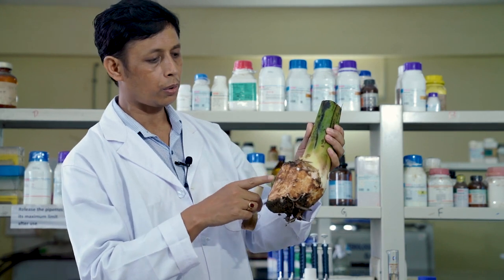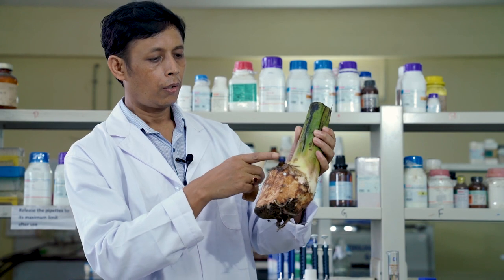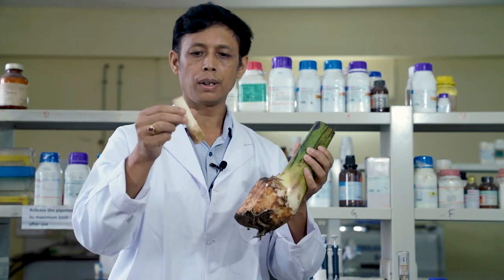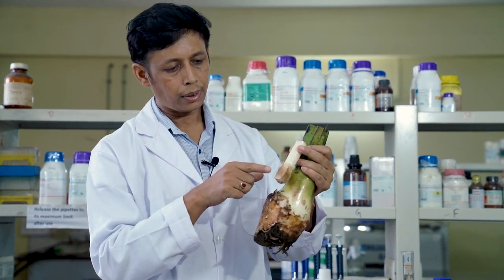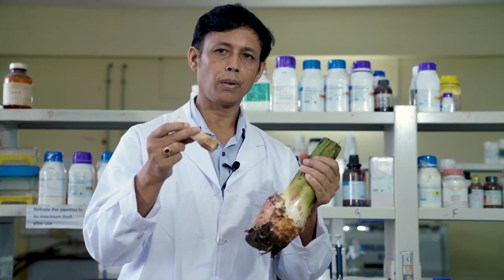Now this explant has two parts. The lower portion is known as rhizome. The upper portion is known as pseudostem. From rhizome and pseudostem, we extract the inner portion, and this is known as the inner shoot meristem. Now, to initiate the culture, as you can see, this has turned brownish in color. So to reduce the browning, we'll treat this explant with ascorbic acid solution.